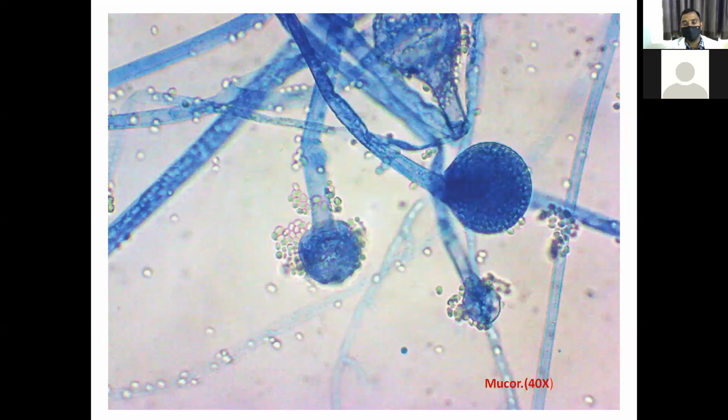This one is Mucor. How will you tell? For Mucor and Rhizopus, for Mucor there are no rhizoids. Beneath the surface there are no root-like structures. That one is Mucor; for Mucor, rhizoids are absent. Only sporangiophore and sporangia will be seen. Sporangia are above the surface; beneath the surface there are no rhizoids. This one is the sporangiophore, with a stalk-like appearance, and the sporangia.